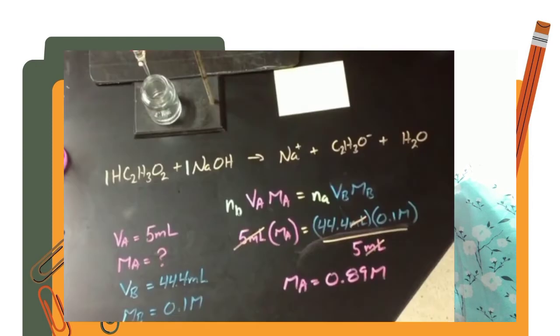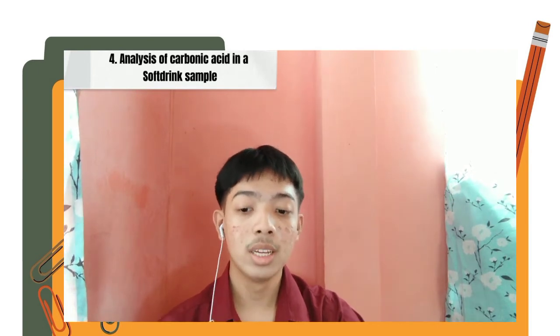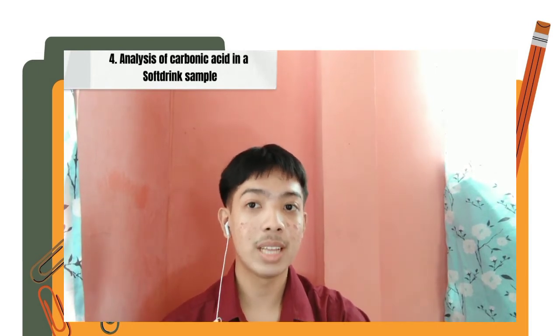And then sa last part ng video, nakita rin yung pagka-calculate ng mga kailangan natin like yung molarity of the acetic acid, doon pinakita rin sa video. And then, fourth step, yung analysis naman ng carbonic acid doon sa ating soft drink sample.